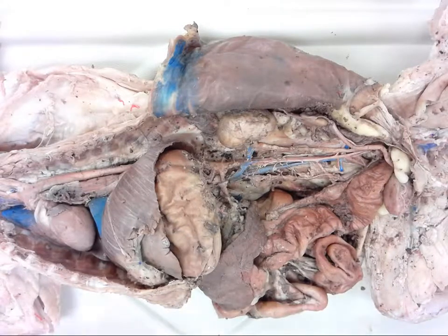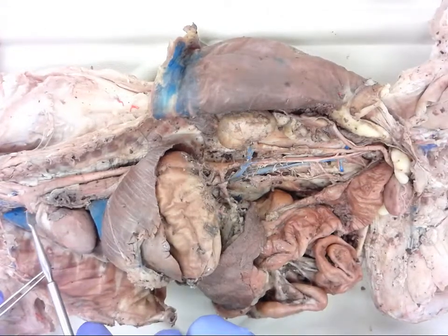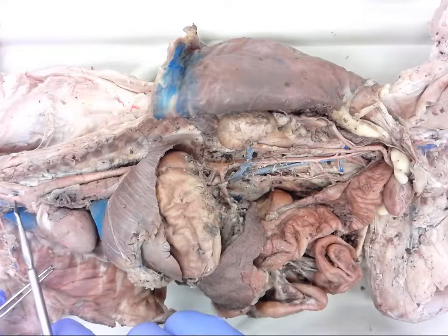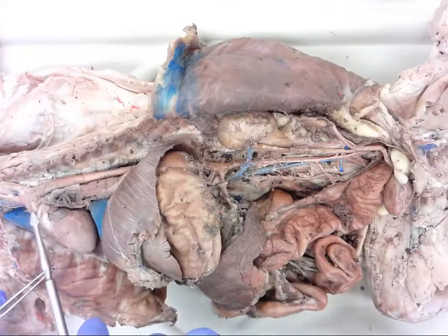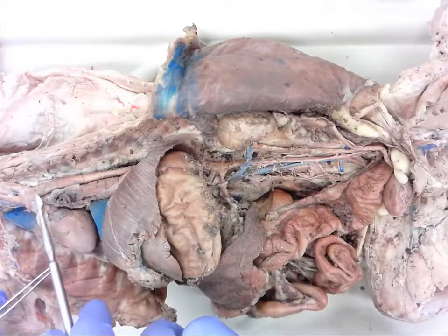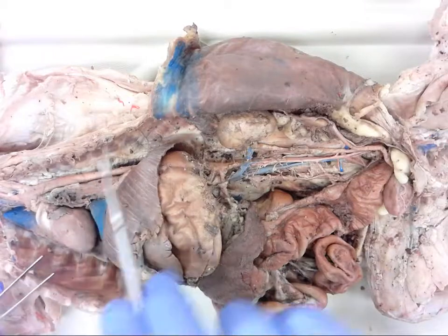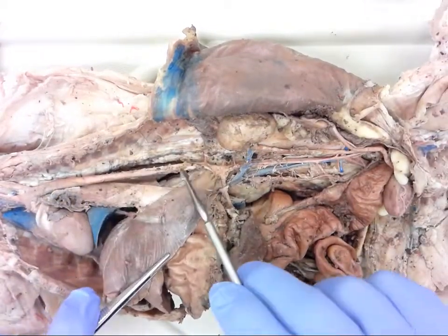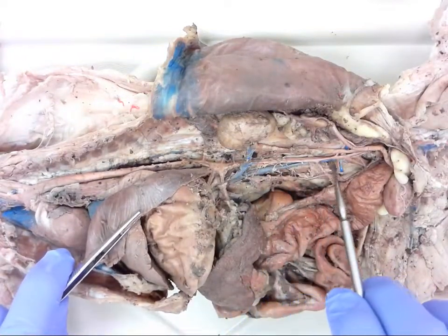So, as we know, coming off of the heart, we have the aorta. Up here at the top, or to the left of your screen, there's the aorta with the branches going up to the head and to the forelimbs. Any blood that doesn't go there is going to continue down the aorta. This is the descending aorta. It's going to pass behind the diaphragm. And once it reaches that point, it is now the abdominal aorta.